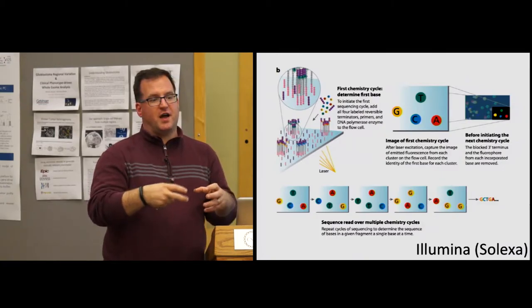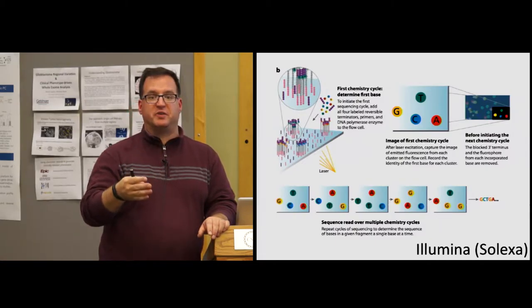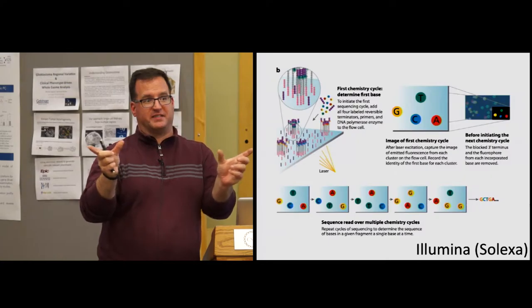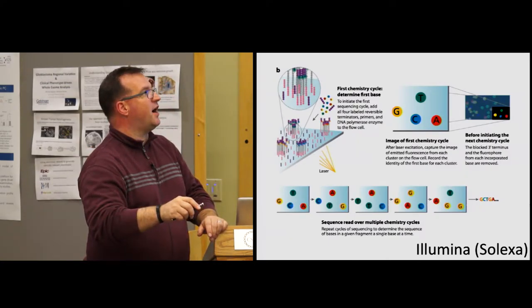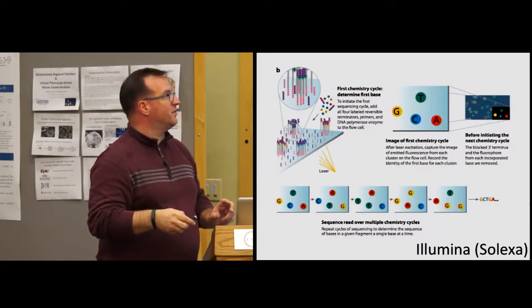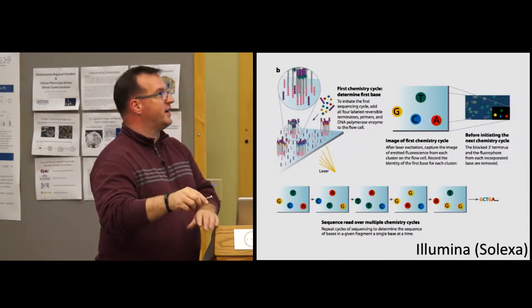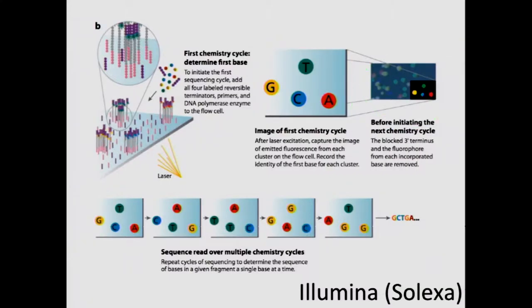Okay, so those sorts of optical artifacts can exist, and later we'll talk about looking at duplicates, reads that seem to be exactly the same and come from exactly the same thing. Often that is because of this sort of optical illusion where the software is tricked into thinking that two different dots are actually two separate colonies when they were actually the same. So we call those optical duplicates. A lot of the fancy footwork for the Illumina comes in the image recognition and the deconvolution of these images into where the actual spots are, where the separate spots are, then as you go cycle by cycle, what's the color that we're actually seeing in each cycle.